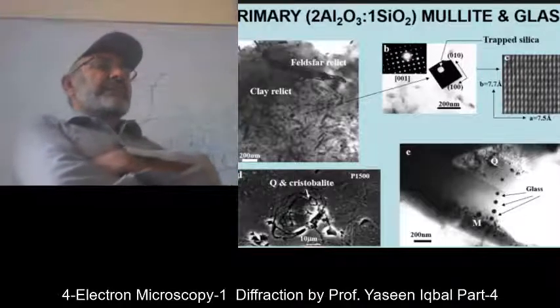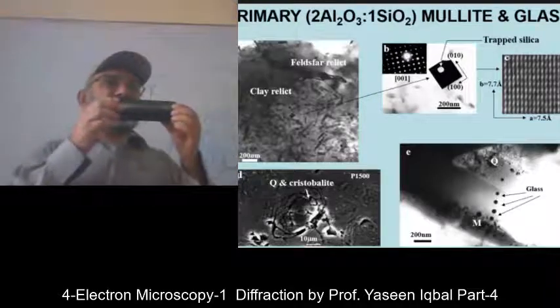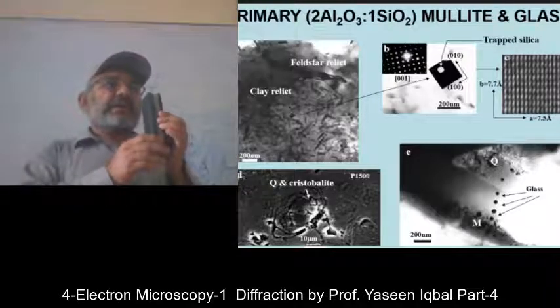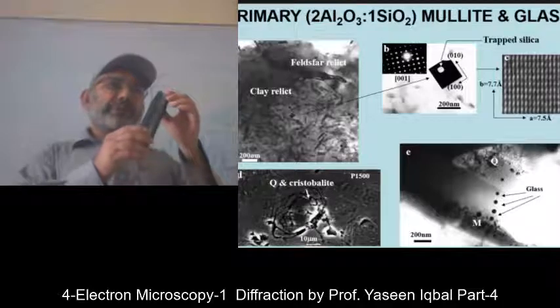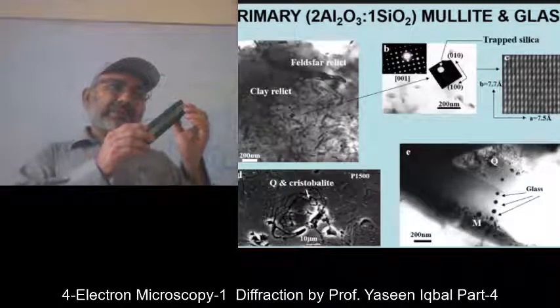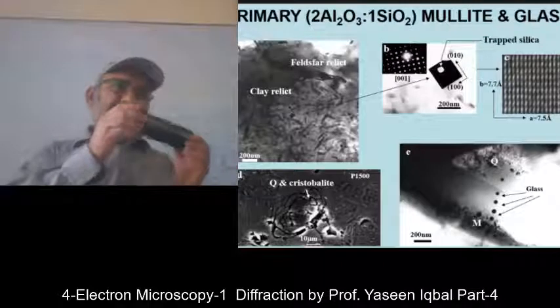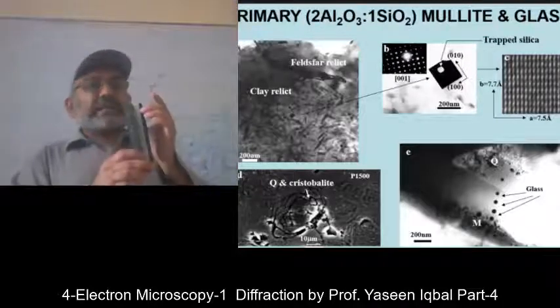Three D image, basically when you combine, I told you that if the crystal is lying like this and you move it, tilt it, you can tilt it up to here, right? It was like this. You tilt it up to here, you tilt it up to here. You can't tilt up to here.